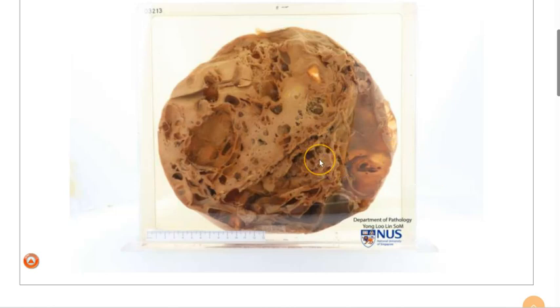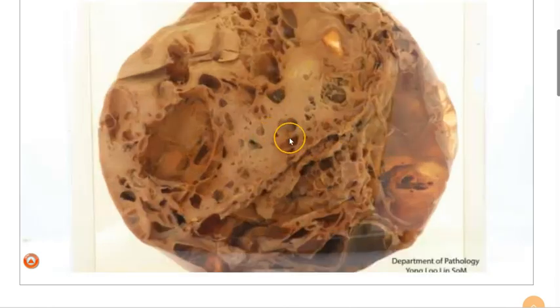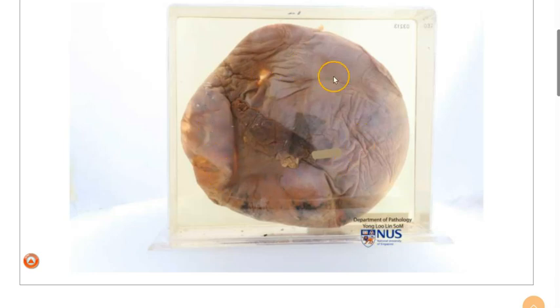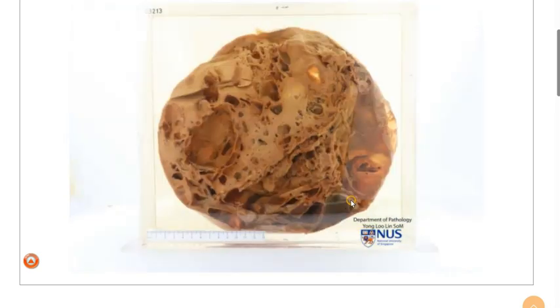Hence, in summary, this is an adult granulosa cell tumor, which is a tumor arising from the granulosa cells, or it is considered a sex cord tumor of the ovary. It often has a solid cystic cut surface and sometimes with areas of hemorrhage and necrosis, and this tumor is usually encapsulated and well circumscribed. It is an indolent, slow-growing tumor. However, it does have a significant recurrence rate.